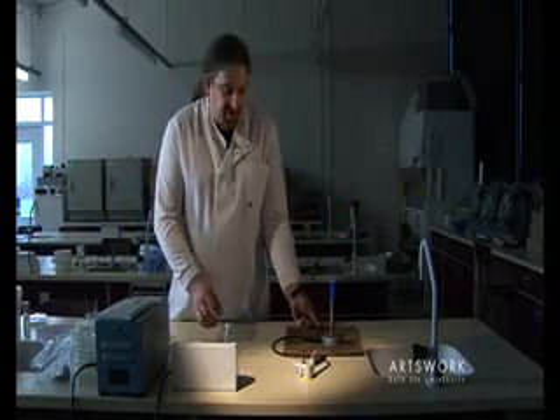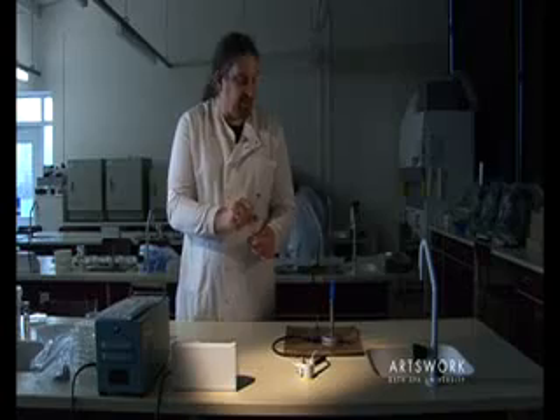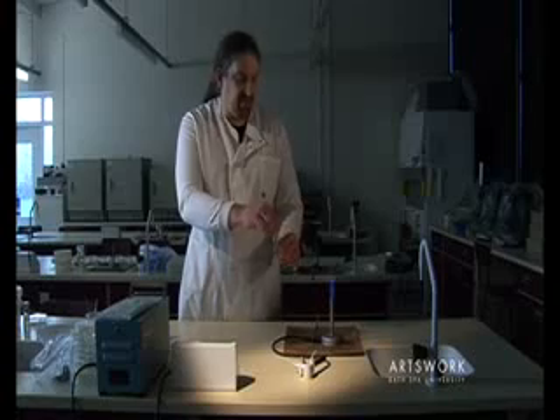The same applies if you're using the flame to sterilise bottles. Once you've opened the bottle, pass them through the hottest part of the flame to sterilise them.